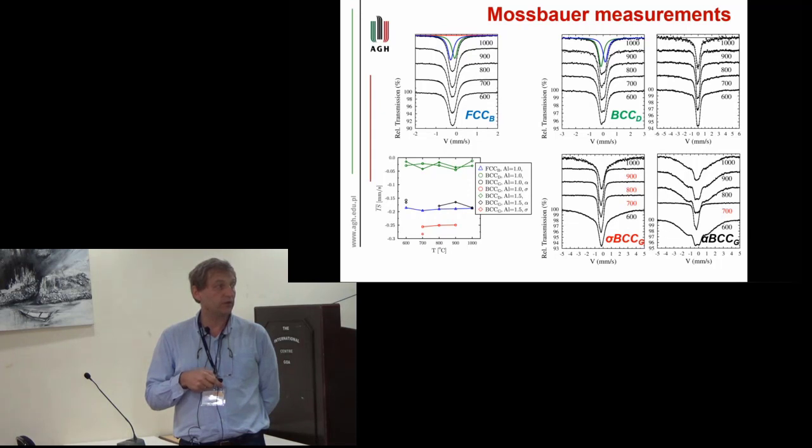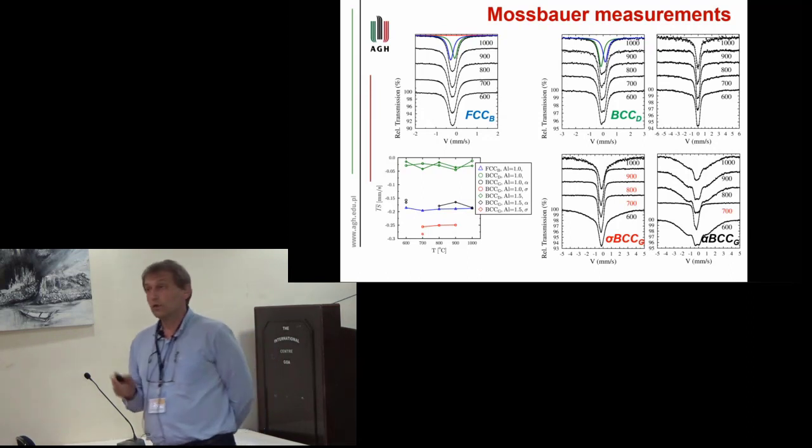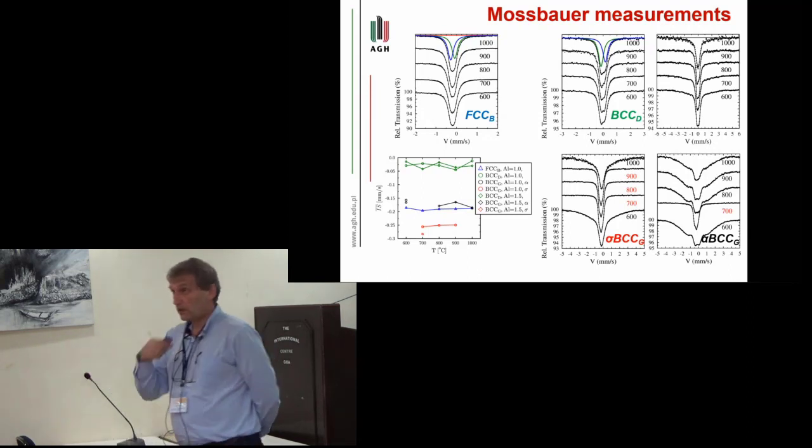The last one, BCC gray phase, transforms in some temperatures into the sigma phase. For example, in these temperatures marked by red, you have completely different spectrum, different parameters corresponding to the sigma phase. This is again magnetically split BCC gray phase.